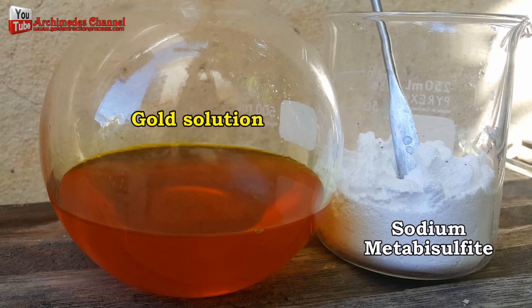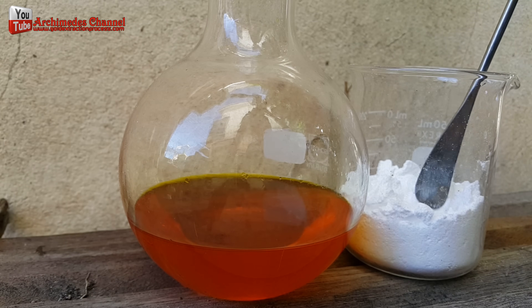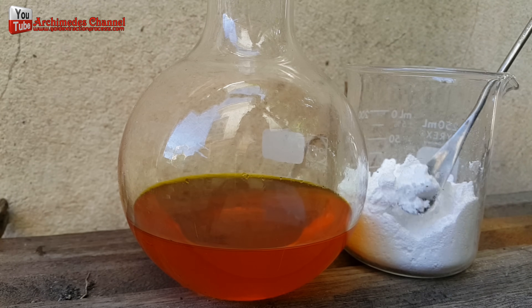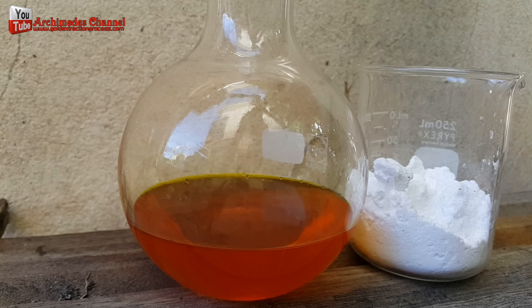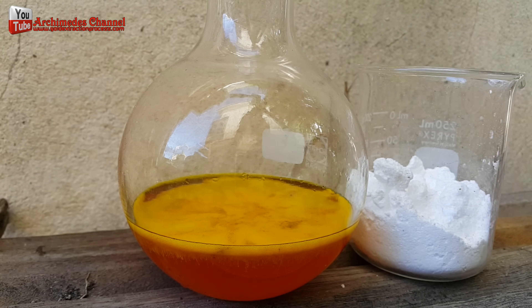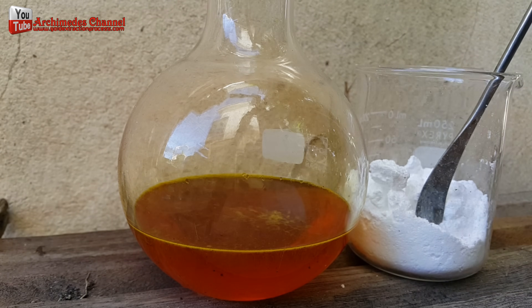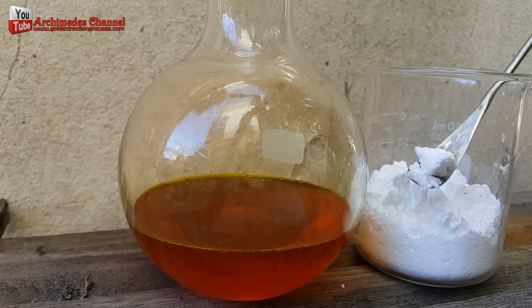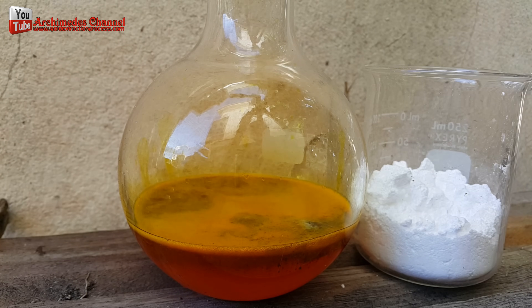Using sodium metabisulfite, I managed to get the gold to settle as sediment at the bottom of the aqua regia solution. I slowly poured in the sodium metabisulfite until reaching saturation level, or until the sodium metabisulfite stopped dissolving. At this point, the brown sediment of gold could be seen. I let the solution settle for 30 to 60 minutes.